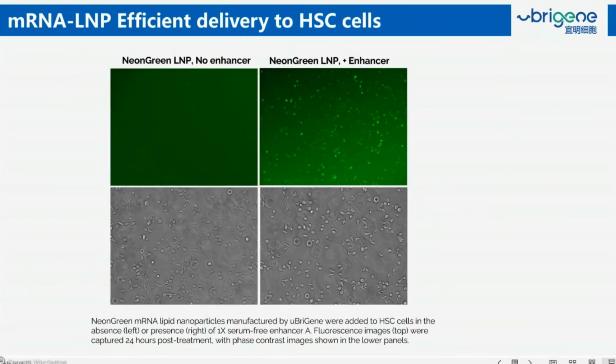They're also efficient at delivery to hematopoietic stem cells, again showing the same demonstration of expression of GFP following the addition of the enhancer into the tissue culture. And these images, again, are 24 hours post-delivery of the LNP.